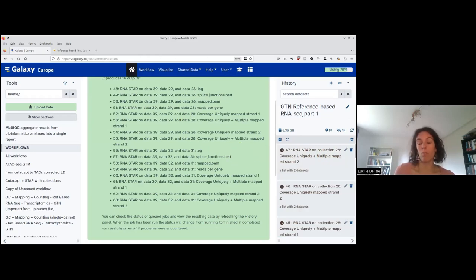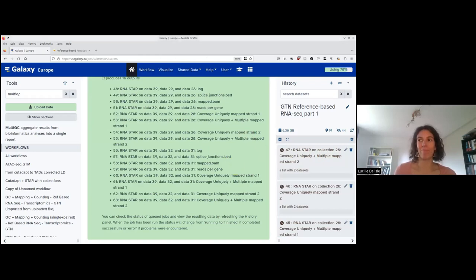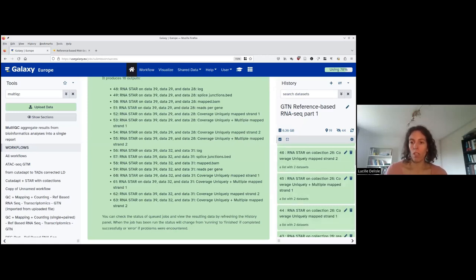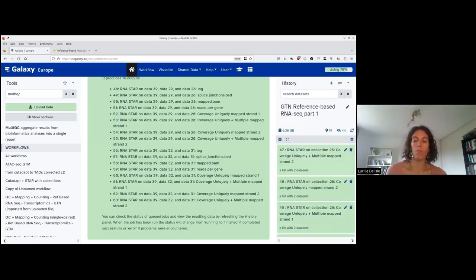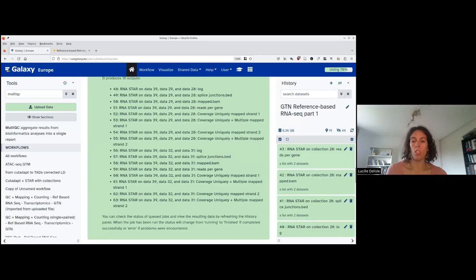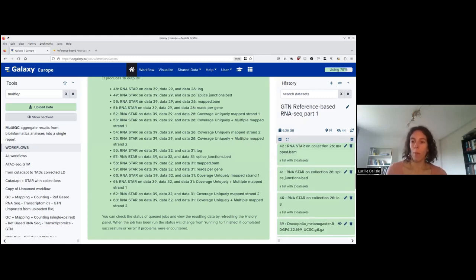STAR can also count the number of reads per gene automatically while mapping, without taking more time, so we enable that option. We also enable 'Compute coverage' in BedGraph format, which can be useful for quality checking on specific regions. We leave everything else by default and run the tool. This step may take a while — time to take a break. STAR has finished. There are many outputs: the first four are coverage tracks, then reads per gene, the most important BAM file, a splice junction BED file showing where junctions occur, and a log providing mapping quality information.